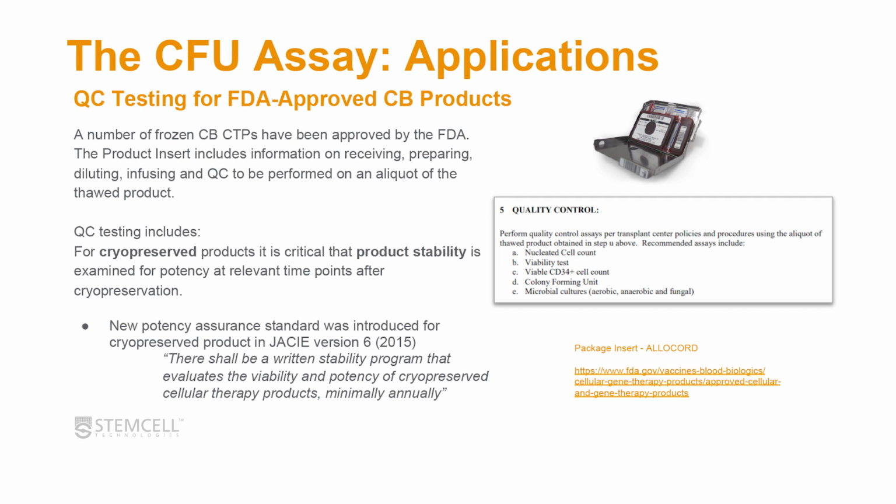They also ask you to do the CFU assay, of course, for potency, and a microbial test to make sure that you have the sterility. So these QC tests really are because the product is cryopreserved, and you want to make sure that it is stable, that it's transported okay, and that the product that you gave the patient is actually, you can confirm with the CFU assay, was actually a good product.